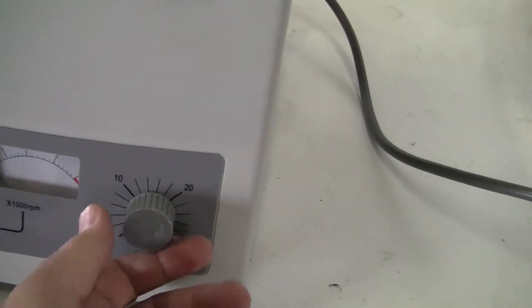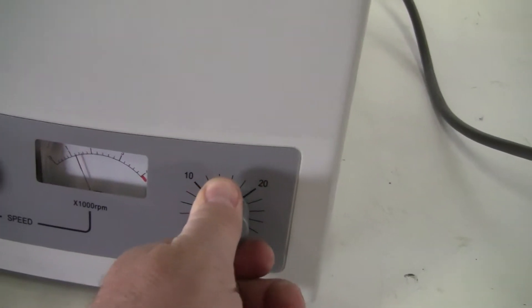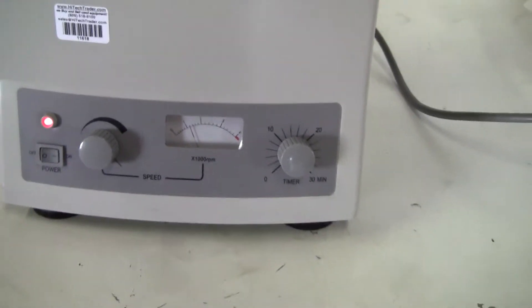Let's start it up. It's got a 30-minute timer on it. It goes up to 4,000 RPM. It runs on 110 volts.